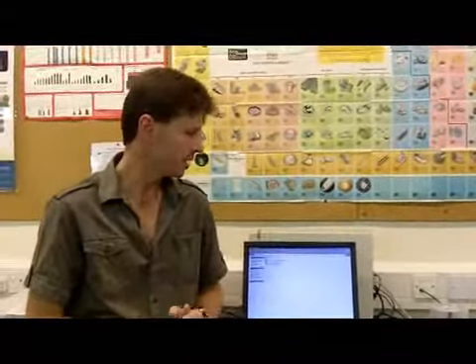Okay. The most important thing to keep in your mind is the XPS tells you what's on the surface. It tells you what elements are present, it tells you how much. And throughout your analysis, you've got to keep that in mind. Refer back to the XPS every time. What's on the surface at this point? That will help you to interpret the next set of data.